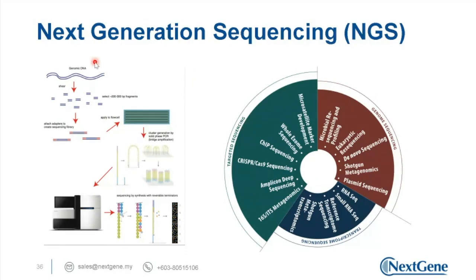In NGS, we just break the long DNA into shorter fragments, sequence all these short fragments, and then join them together into a single unit using bioinformatics computing.